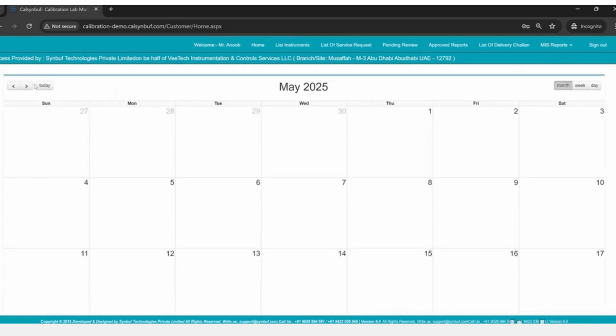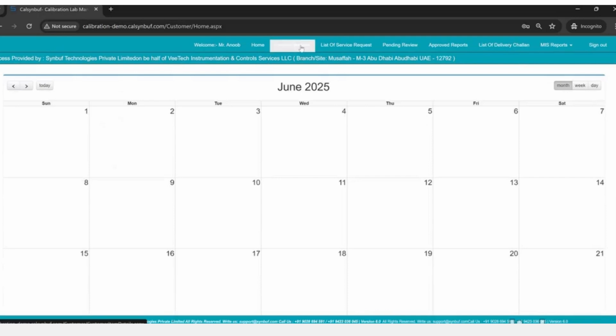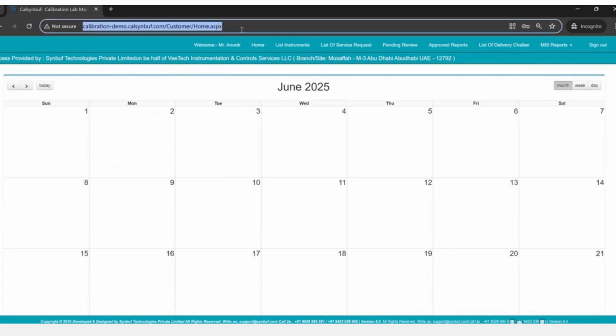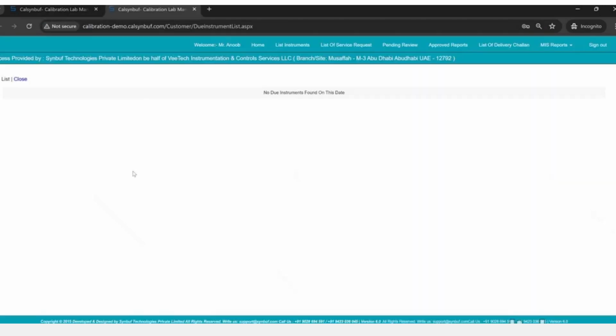We may have some due, right? There is no data here so the counter is not coming, but whenever any customer logs in, he can see how many instruments are due today. If I click there, the list of instruments that are due will pop up.